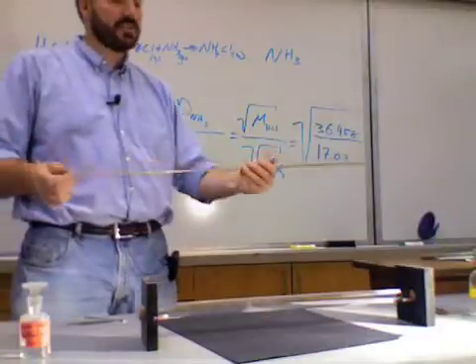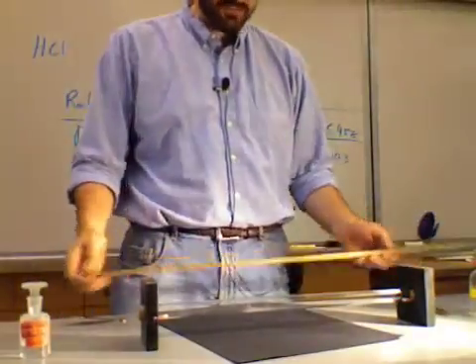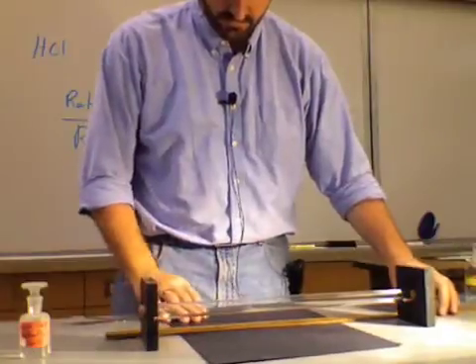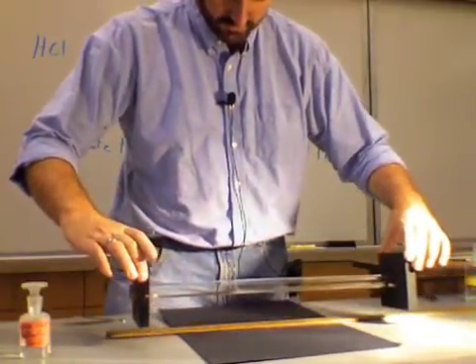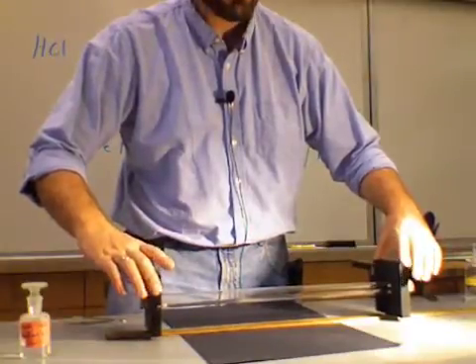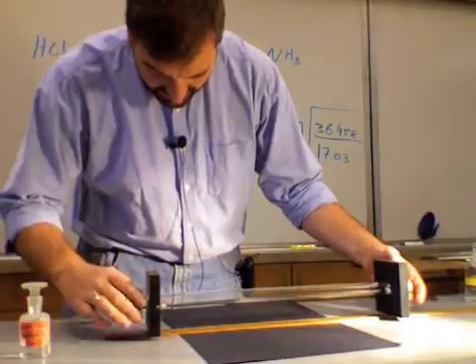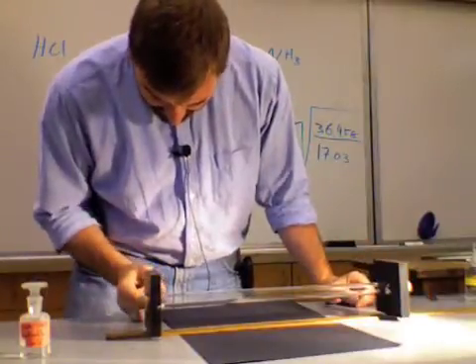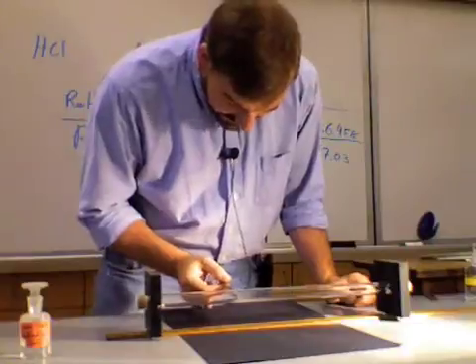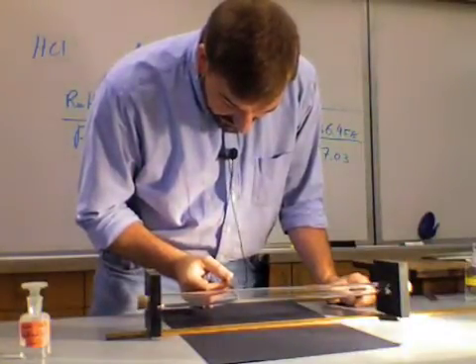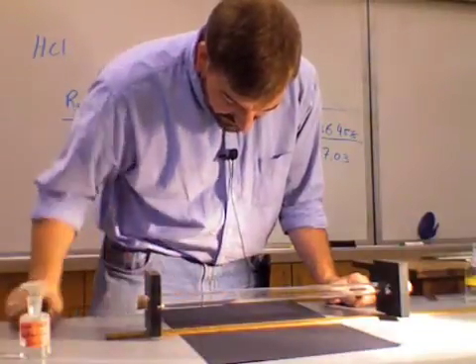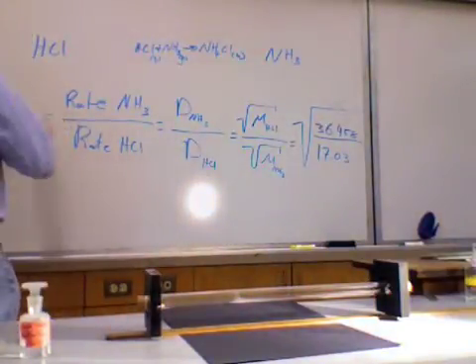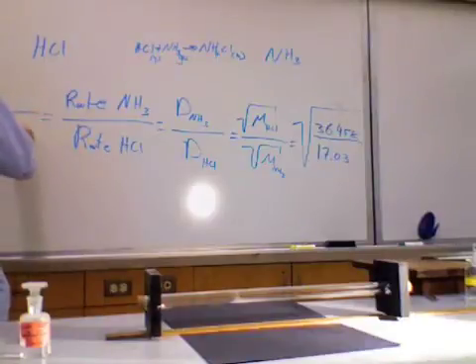So let's go ahead and actually compare that measurement. Let's make this measurement here as best we can. I'm gonna be a little careful here. Is everything okay over there, guys? Alright, so I'm gonna try and line this right up on top of this ruler here. Put the tip there at 10. So that's gonna be like our zero, our start. And then the line looks to be about twenty-three. So that's thirteen point, let's call it thirteen point five. So it looks to me like the ammonia or the hydrochloric acid traveled about thirteen point five centimeters.